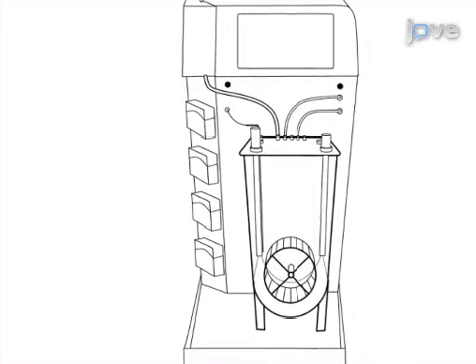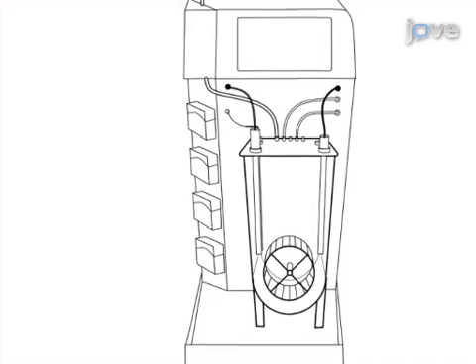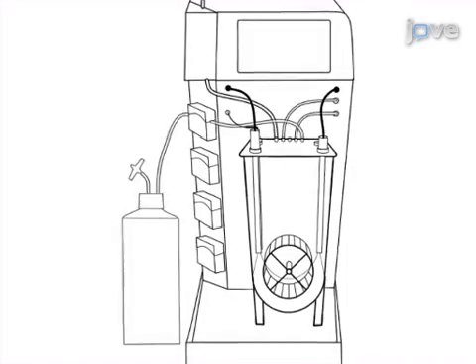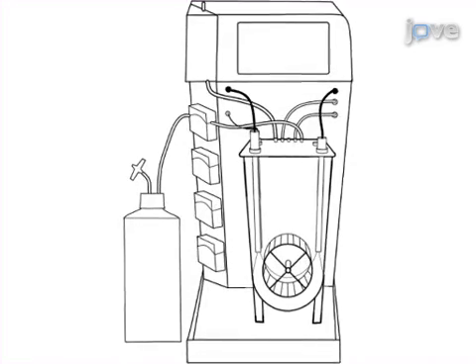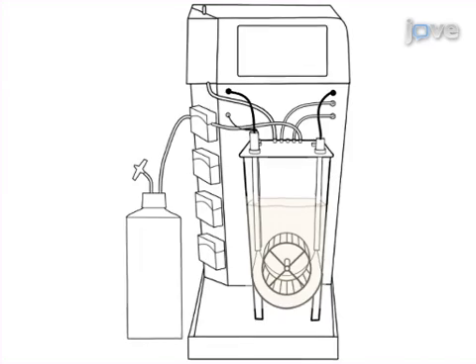The next step is to connect the DO and pH cables and to aseptically connect the medium and microcarriers, which are pumped into the bioreactor.